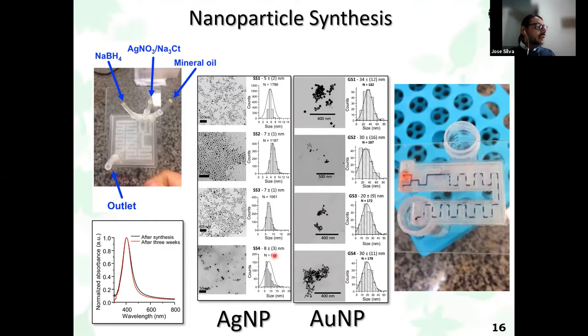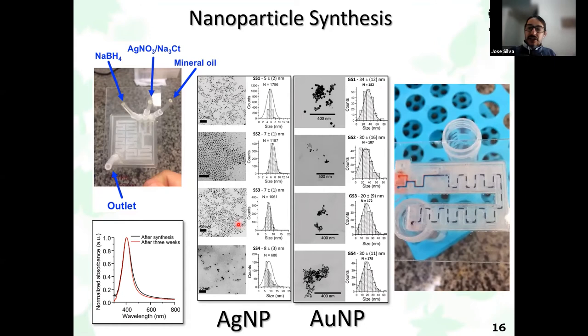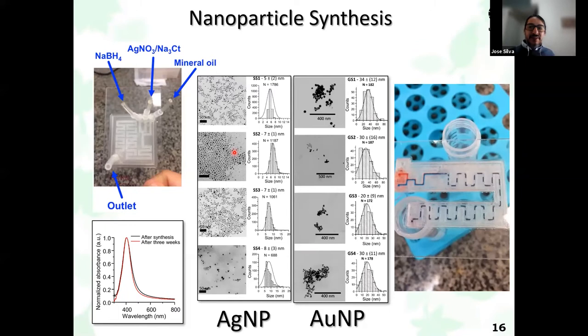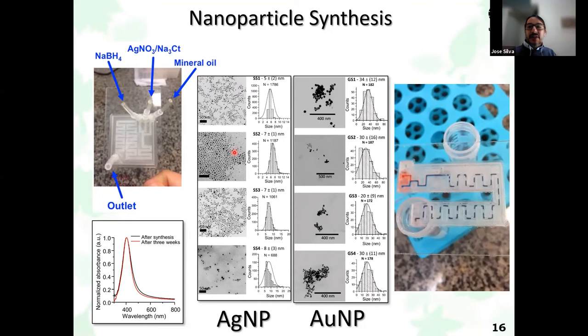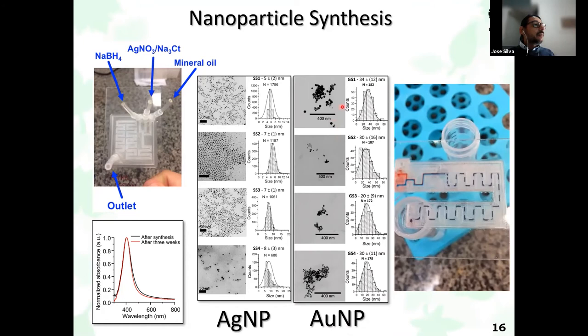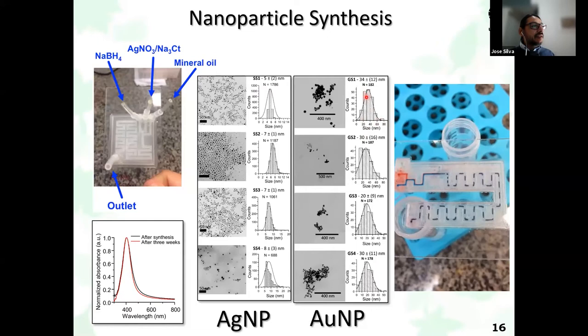So just by combining the concentration of the reagents and also the flows, you can adjust the size of the particles you want. So this is interesting. It's much easier to control in a microfluidic environment than in a batch reaction, because it's really large. It's difficult to control the mixing. So it's much easier in a microfluidic device. Here is an example for gold nanoparticles with 34 nanometers, 30, 20, 30 nanometers. It's also with an interesting distribution of size.